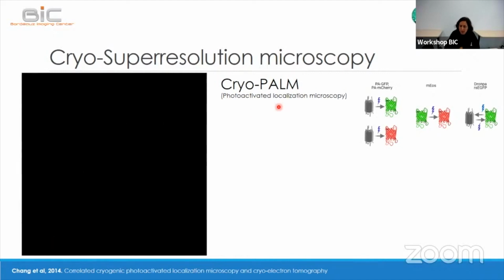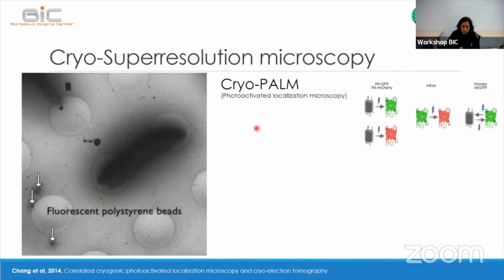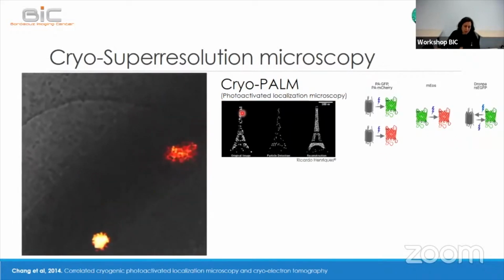These proteins are photoconvertible. As you can see here, we have a whole workshop dedicated to super resolution from Magali Mondan. I am not going to go into the details, but this whole protocol uses the property of these proteins to be controlled by light and the activation, and then we can see the activation in different space and time, and then we can really localize them very precisely.